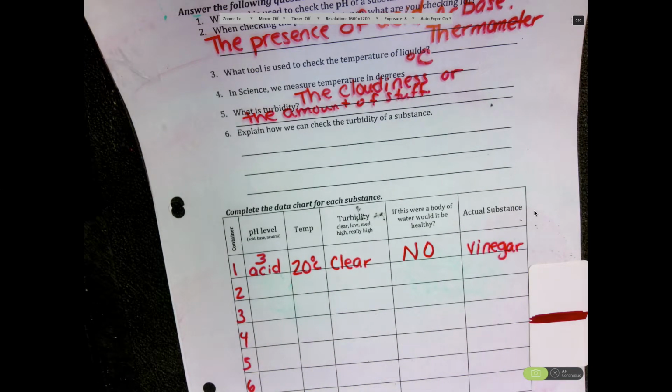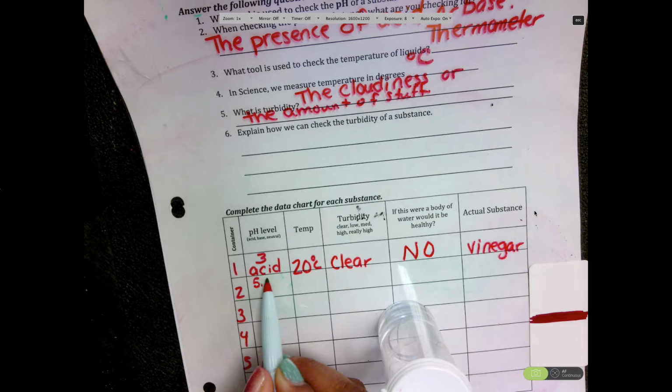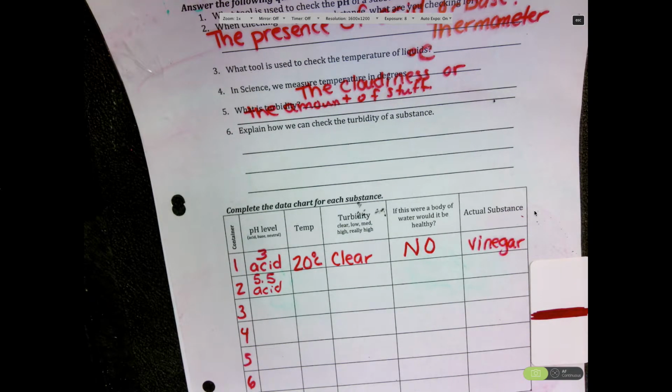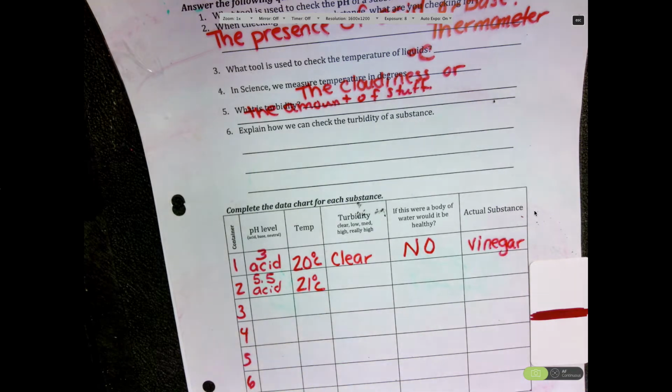All right. For our second substance, that's this here. Our second substance has a pH of 5.5. Acid, base, or neutral? Acid. The temperature? It's 21 degrees Celsius.